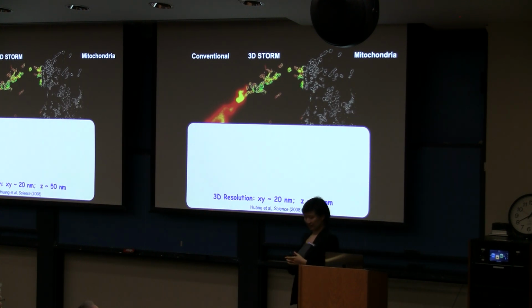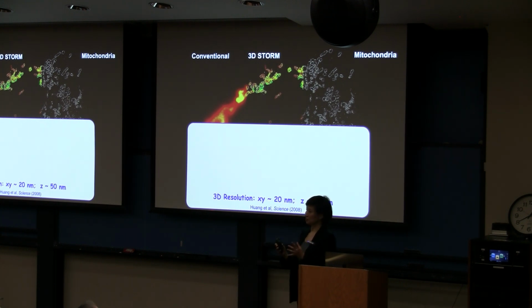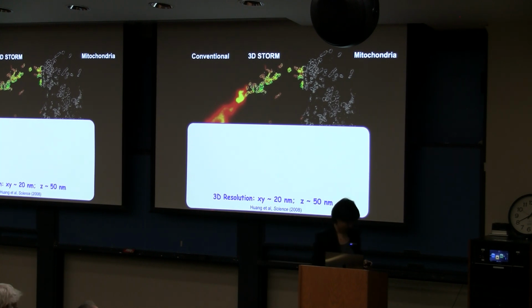I should say that there are multiple different ways of determining the 3D. Astigmatism is a simple way, but for example, W. Moerner has developed this PSF engineering approach to turn the wavefront into this really cool double helical structure, and later on a single helical structure and corkscrews. He likes to play with wavefront engineering. And there are also interference approaches to get you even higher Z resolution than these, shaping the wavefronts and the point spread function and so on.